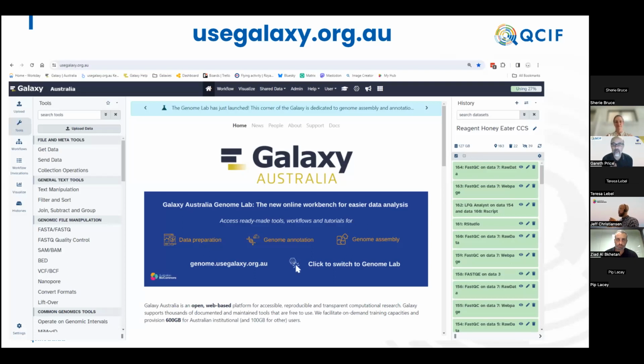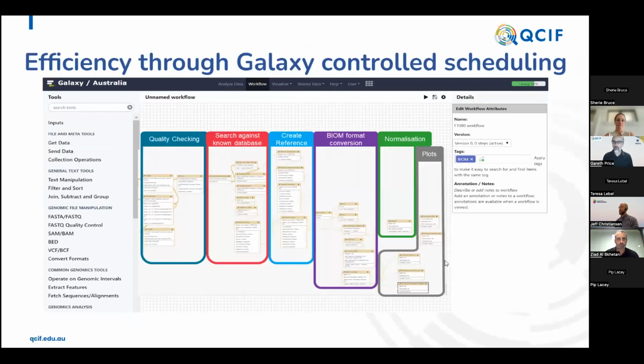Jeff's done a good overview of slides, so I'm really going to skip through mine and go for the always on the edge of your seat live demo option today, so you can see Galaxy working. So I'm not going to belabor the screenshot. You'll see the software in a minute. What I really wanted to highlight, Jeff's already said, and I'll stop saying that part.